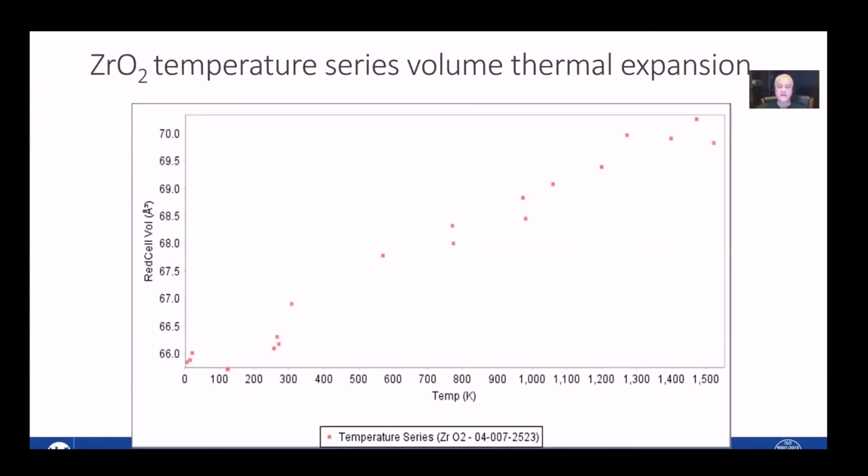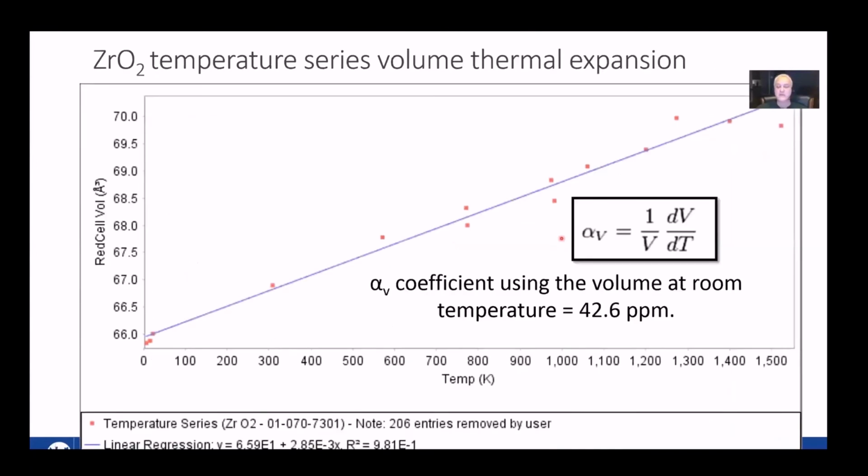If you look at the data here, plotted out, you can fit a curve to that. You have the option of looking at linear, quadratic related curves. This is nominally linear, and you can pull out the thermal expansion of the zirconium oxide tetragonal phase based on this data.